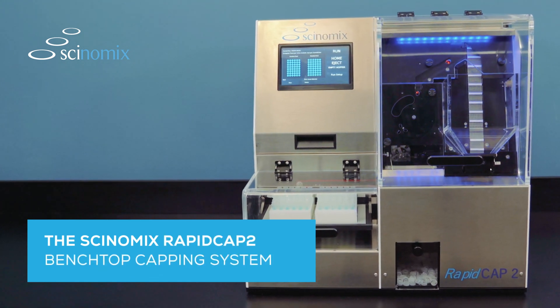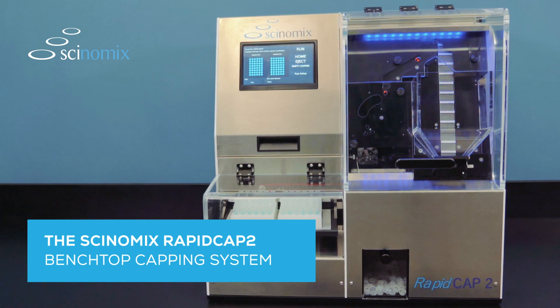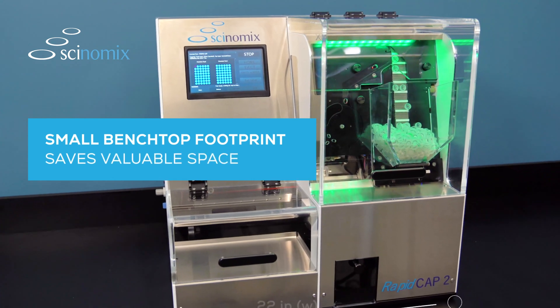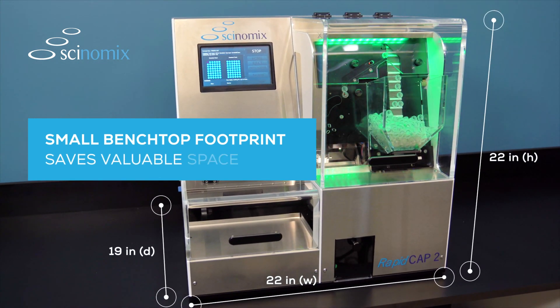Save time automating manual capping and decapping processes in your lab with the Synomics RapidCap2 Benchtop System. With its small footprint, RapidCap2 saves valuable space, keeping your lab clutter-free and efficient.